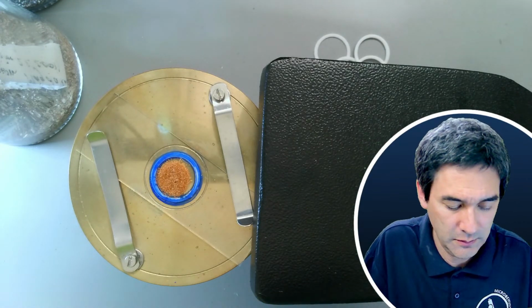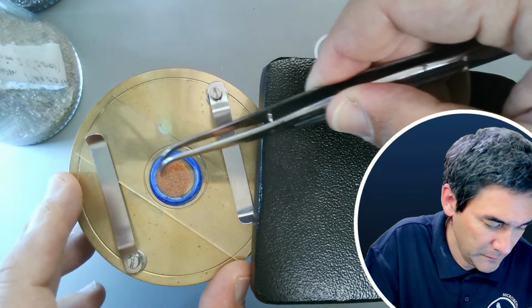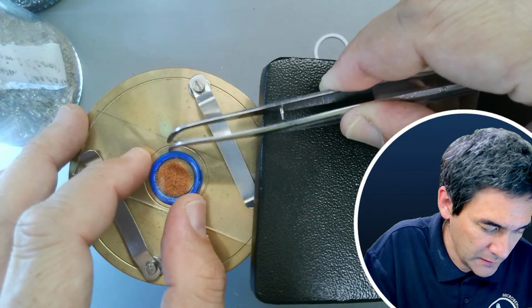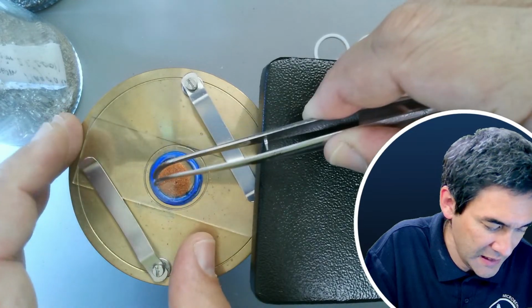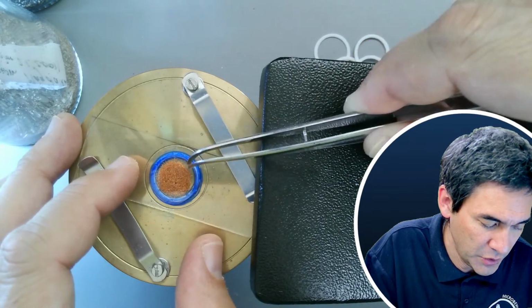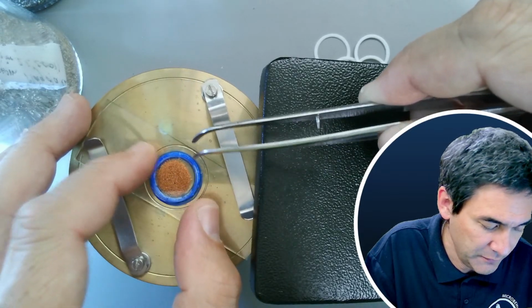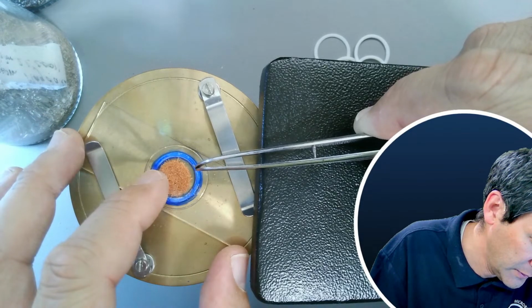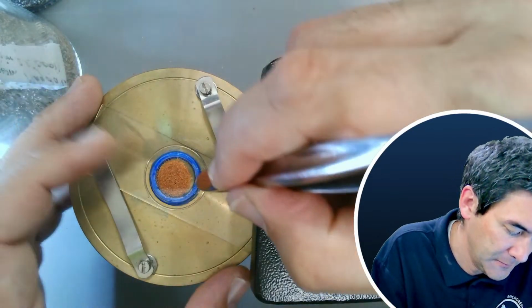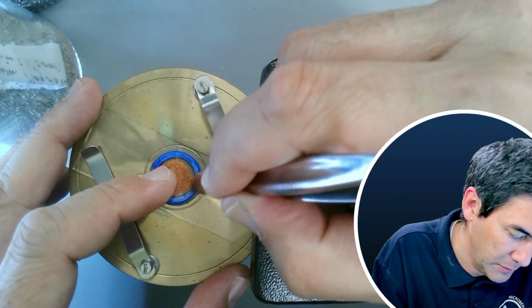One, two, here we go. And let's place it over it carefully. Press down a little bit. Even if it doesn't close off everywhere, I can always add another layer afterwards, and then the nail polish is going to start to flow inwards. See? It was lifted off a little bit. One has to be careful. It has to make sure that there's not too much sand present. Okay, maybe now it works, I hope.